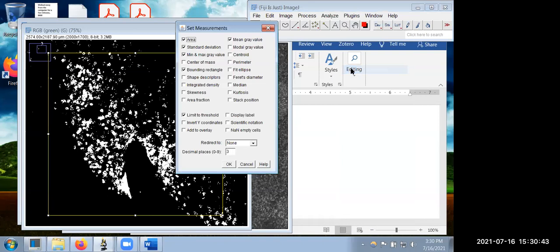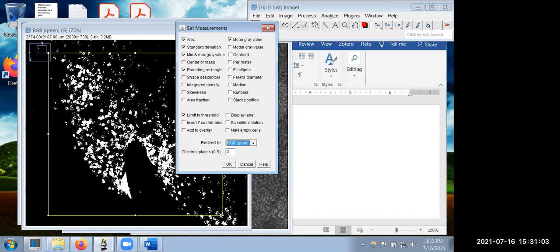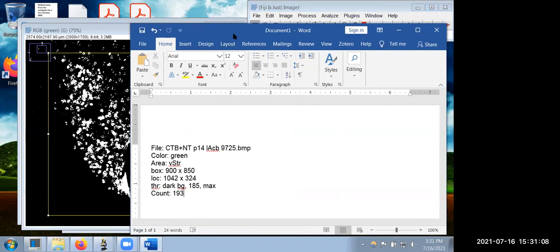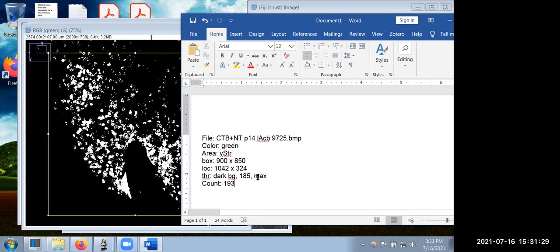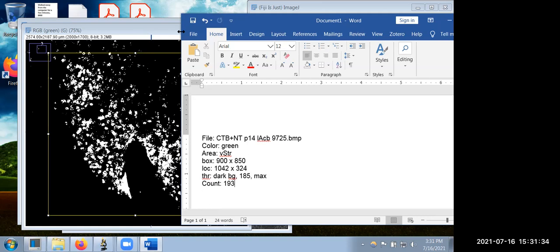Make sure measurements are set: go to Analyze > Set Measurements, check area, standard deviation, mean gray value, and critically — Bounding Rectangle, otherwise it counts everything in the image. Also check Limit to Threshold. Redirect to the specific image you're working with. Hit OK. Copy down all particulars: file name, color channel (green), brain area (ventral striatum), box size in micrometers, box location in micrometers from the top-left corner, and thresholding parameters — dark background, lower limit 185, upper limit 255.